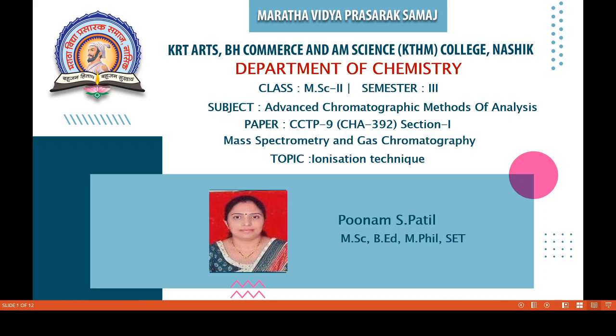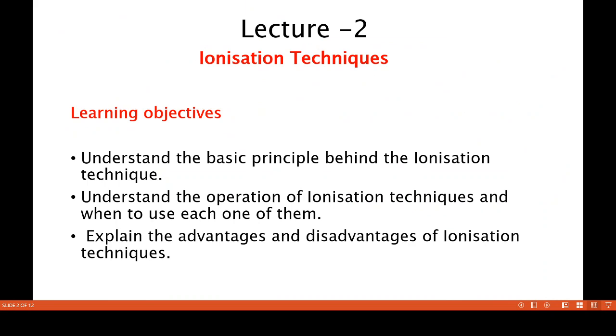Today this is our second lecture. In this lecture we will discuss the ionization techniques involved in mass spectrometry. In the previous lecture we discussed the basic principles of mass spectrometry. In this second lecture we will see the ionization techniques.